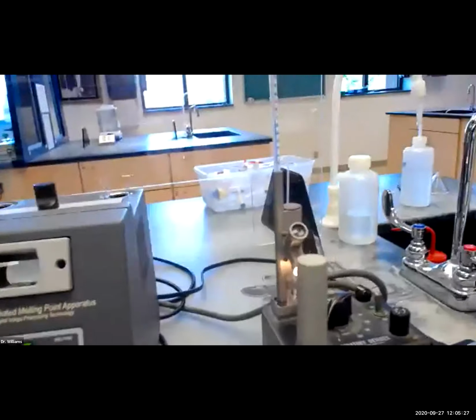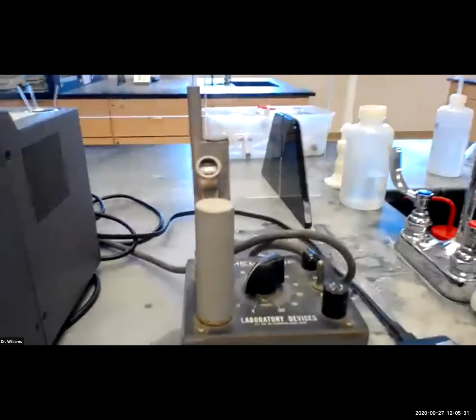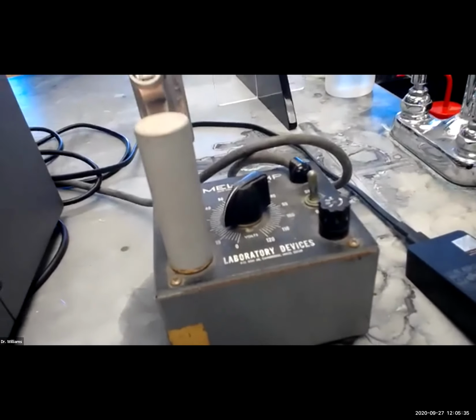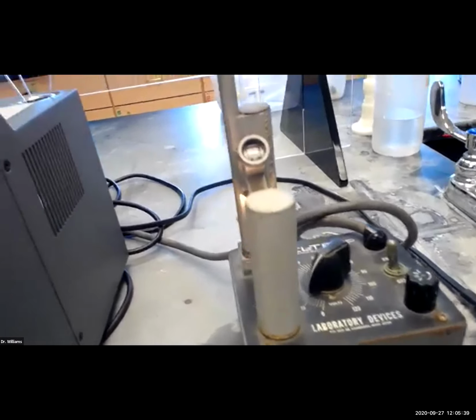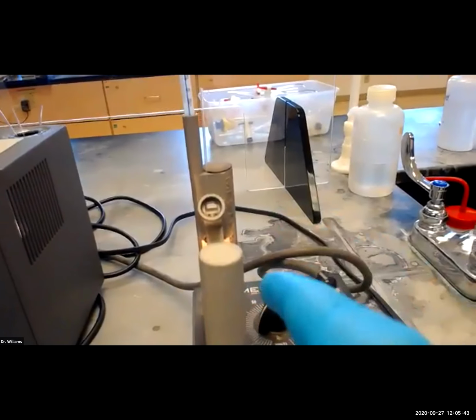Now, this is an older one, it even looks like a dinosaur, right? It's an older melting point apparatus. Some of the universities still use this. So there are a lot of disadvantages. I mean, there's no cooling fan, so you simply have to wait until it cools. And the other thing is that this gets really hot. There's a light bulb in there, so if you get too close, you're going to burn yourself on this.